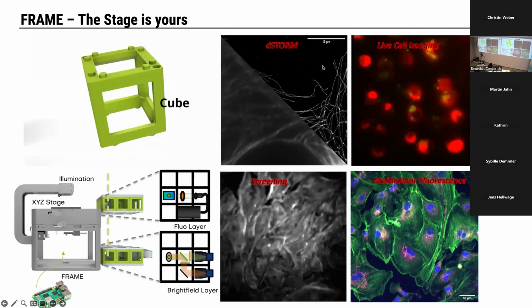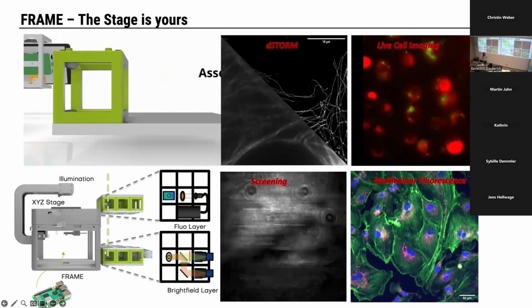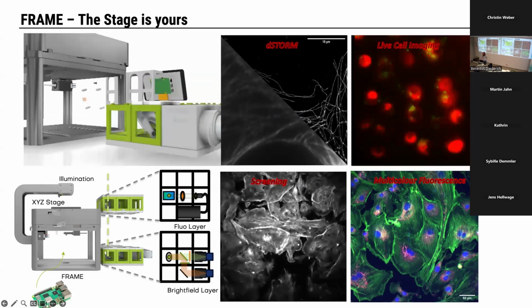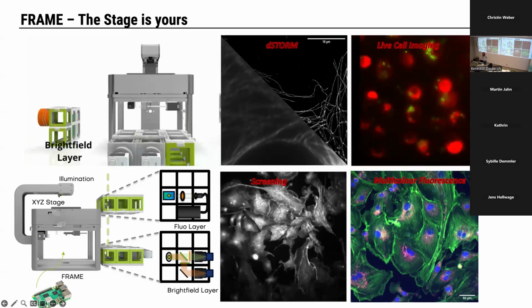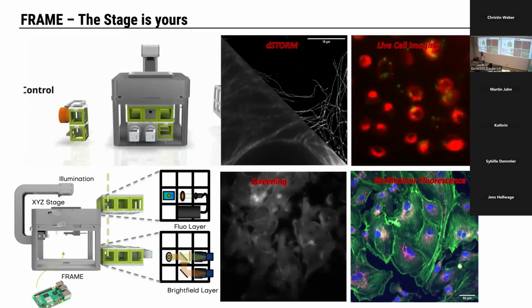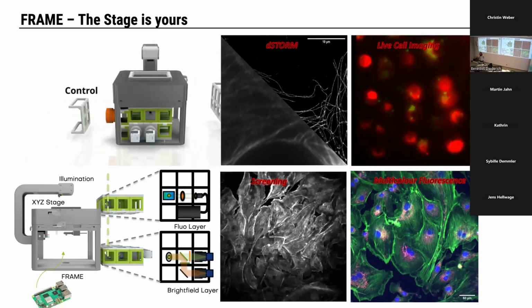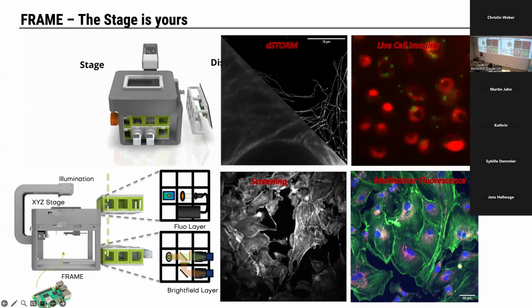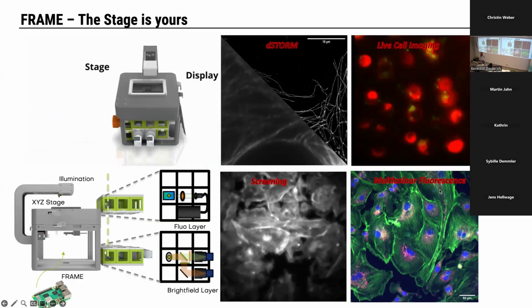So this is some data that is created from other people. This here, for example, is single molecular localization microscopy. So you could go down to single molecular localization level. It means you can detect few photons and go down to 50 nanometers. That's a publication from people in Berlin. And you can do live cell imaging and also multicolor fluorescence imaging.